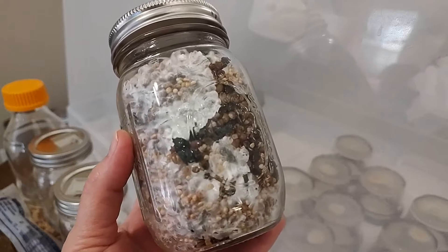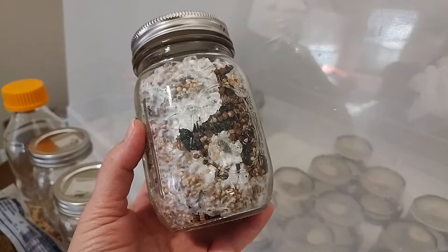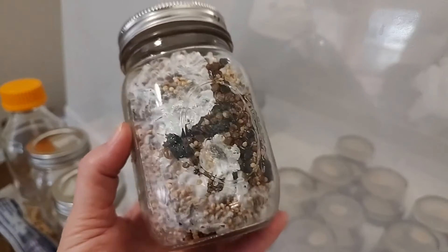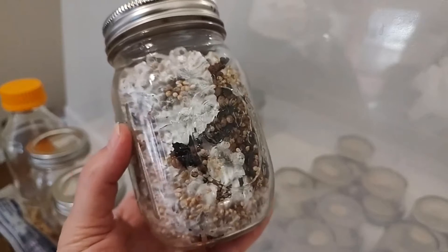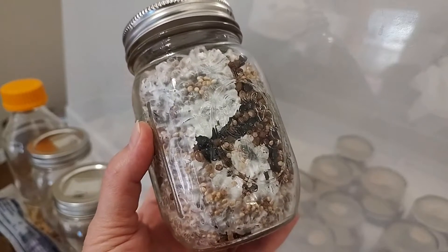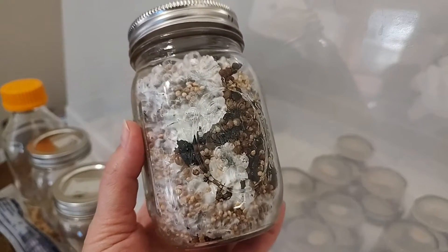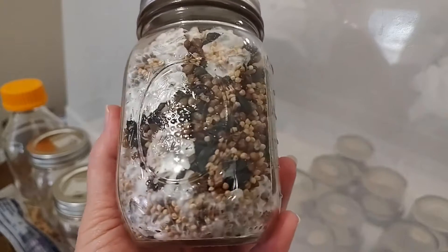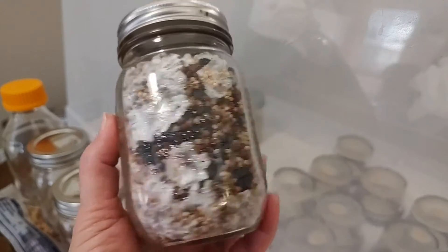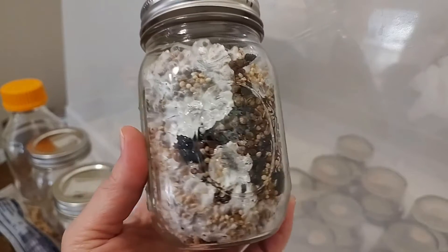The germination process is lengthy. The amount of time it takes a spore to germinate is quite a while. And your grain, your WBS, whatever you're working with — a grain jar or grain bag — can dry out. So you also open the door for problems when working with spores. It is just a better use of your time, money, and energy by skipping the spore process and going straight to creating mycelium.